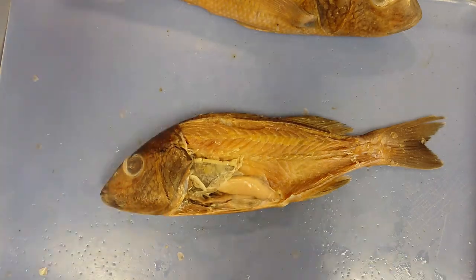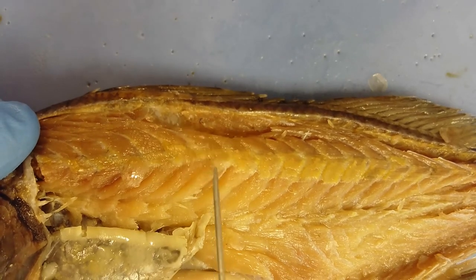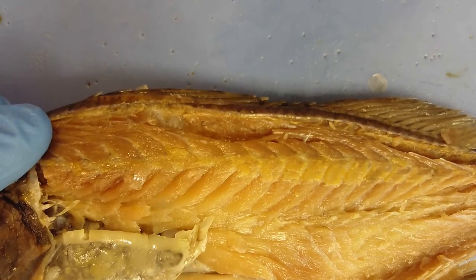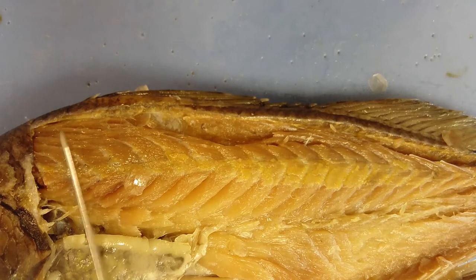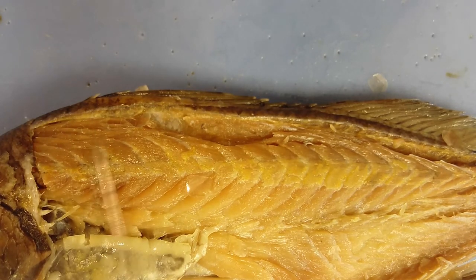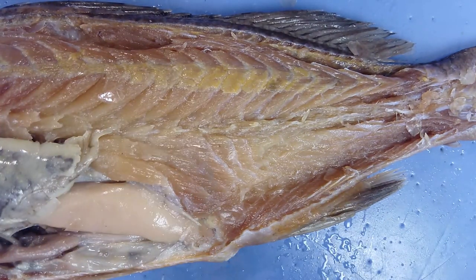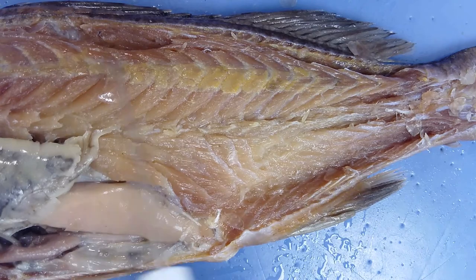These muscle segments are called myomeres. Each segment is separated by a thin white line. The myomeres are shaped like an M or upside-down W. They have a hypaxial region and an epaxial region — the epaxial region is dorsally located along the top structure, while the hypaxial region is ventrally located, with a dark line separating the two.